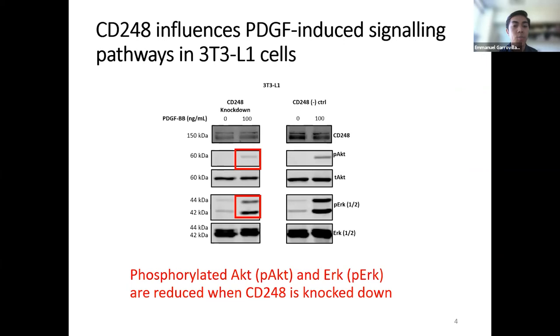Next, to see if this was a functional relationship, we evaluated whether PDGF signaling is affected by the reduction of CD248. We knocked down CD248 in the 3T3L1 cells and used a Western blot to look at the levels of AKT and ERK phosphorylation, which are both induced by PDGF signaling. Here we can see that when levels of CD248 are knocked down, there is a slight reduction in phosphorylated AKT and ERK levels, suggesting that CD248 does influence PDGF-induced signaling pathways.